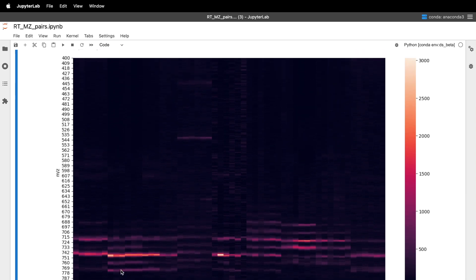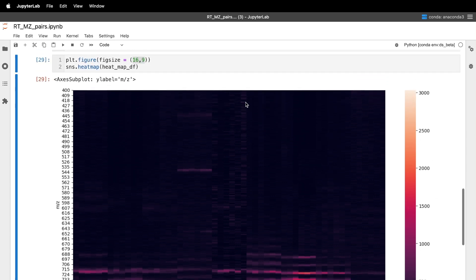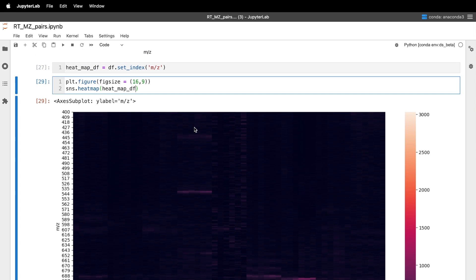Now, one of the challenges can be sometimes when you have these heat maps, because of the false color scaling, it can be difficult to see some of these other minor points. And so we can also alter the scaling.